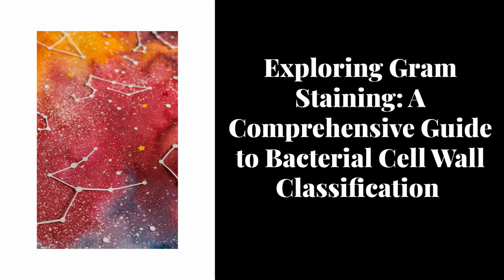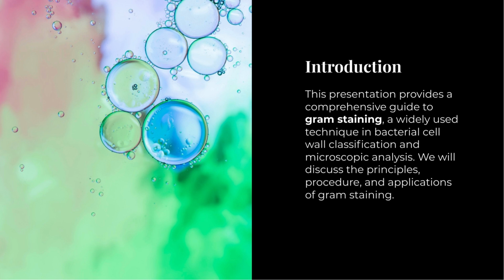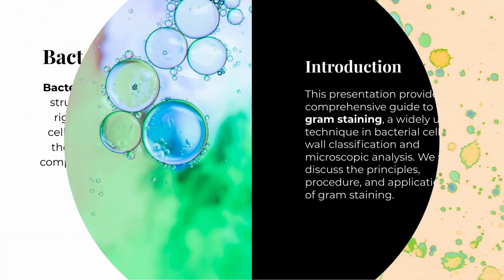Exploring gram staining, a comprehensive guide to bacterial cell wall classification. Introduction. This presentation provides a comprehensive guide to gram staining, a widely used technique in bacterial cell wall classification and microscopic analysis. We will discuss the principles, procedure, and applications of gram staining.